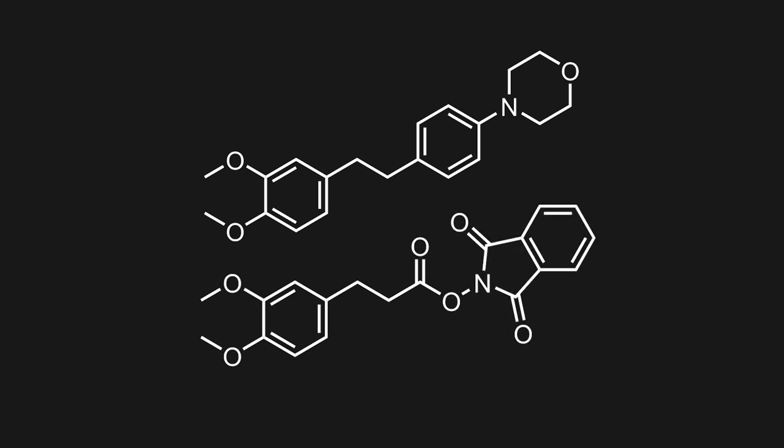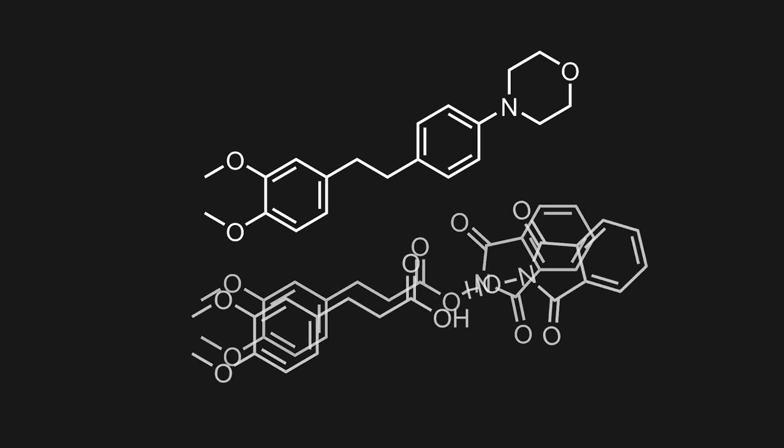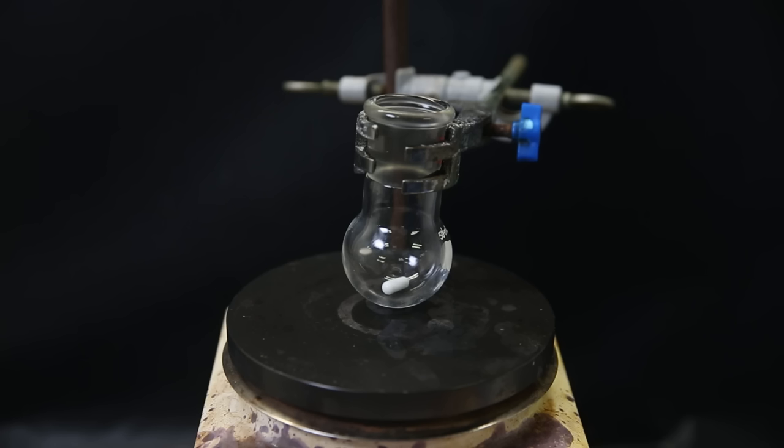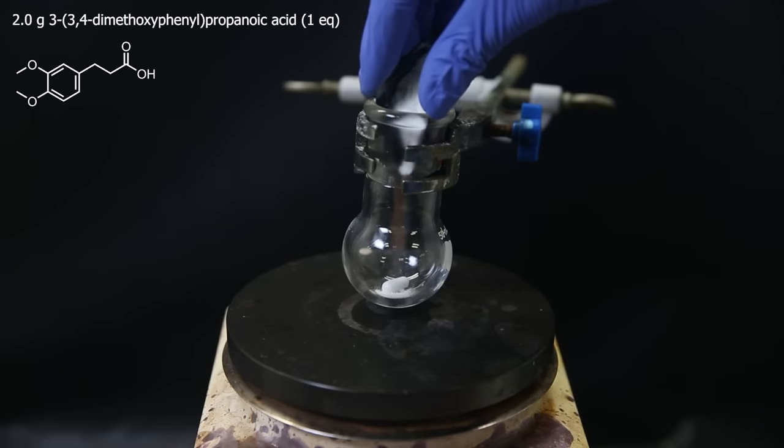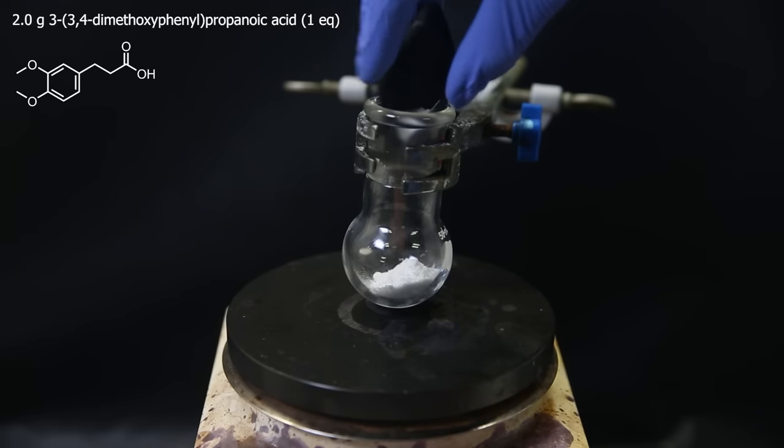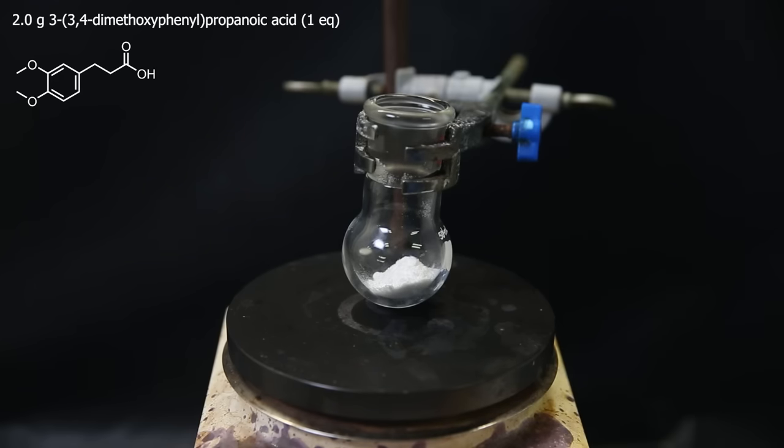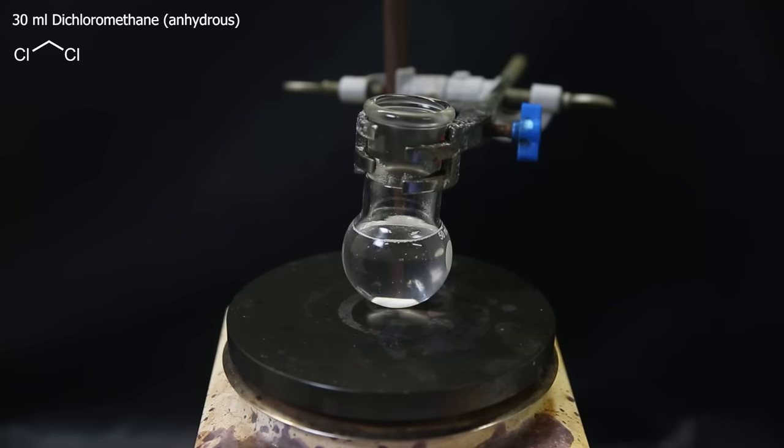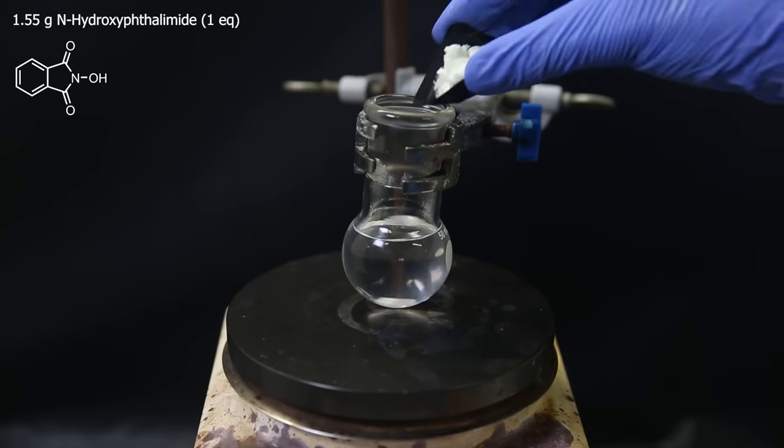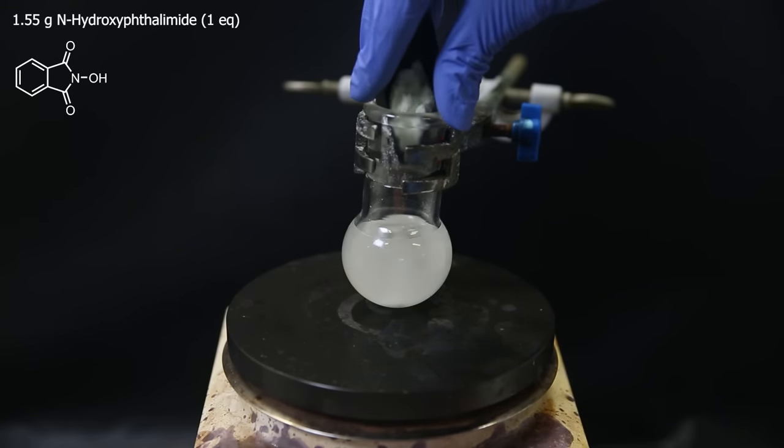And this something is a redox-active ester. Luckily, this is a fairly simple one-step procedure, which is done by esterification of the acid with N-hydroxyphthalimide. So for this, I will use the acid 3-(3,4-dimethoxyphenyl)propanoic acid. Of that, I add 2 grams to a small flask. I then dissolve it all into 30 ml of anhydrous dichloromethane. On top of that, I add 1.55 grams of N-hydroxyphthalimide.